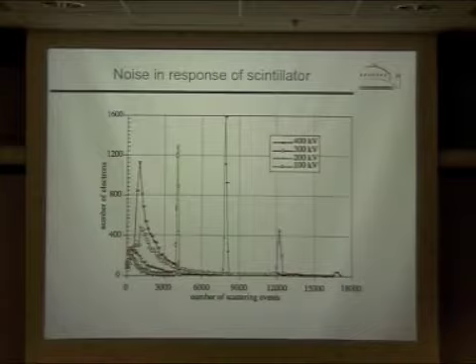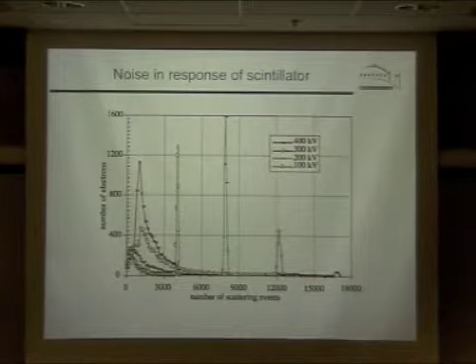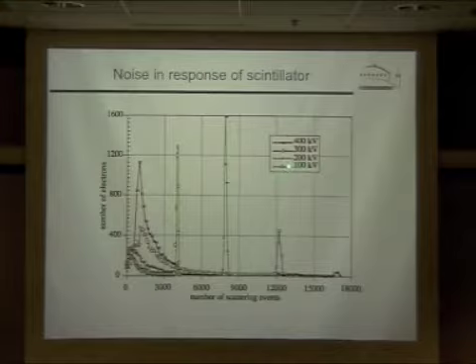And that's shown in this plot here, again from these simulations. For example, this yellowish curve, 100 kV.